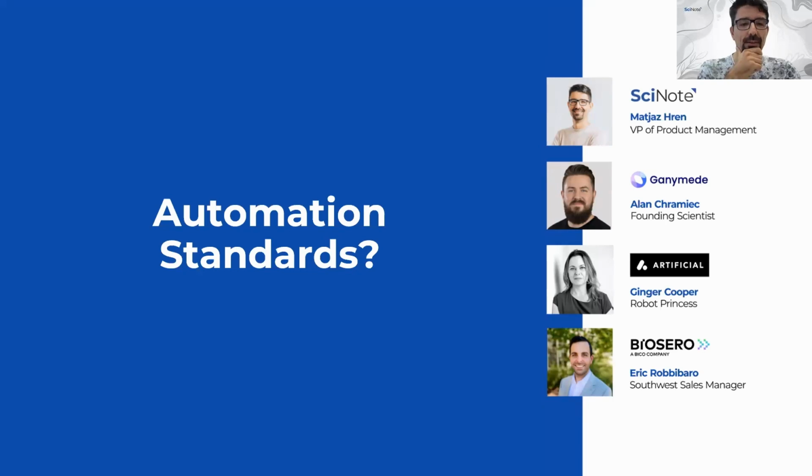Yeah, absolutely. So maybe start off with the fact that there is no obvious single vendor-agnostic or instrument-agnostic standard out there, I'm talking about exchange of data between lab instruments.